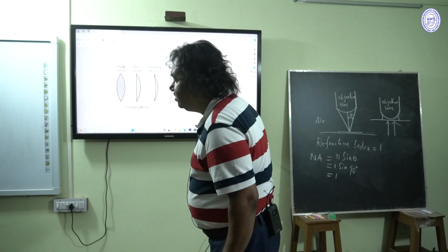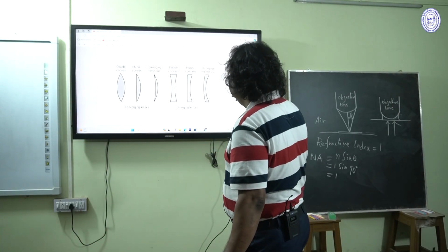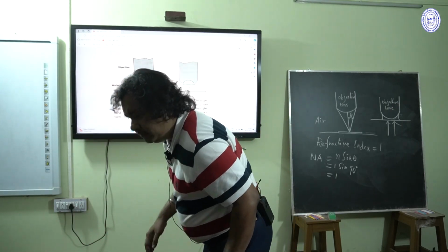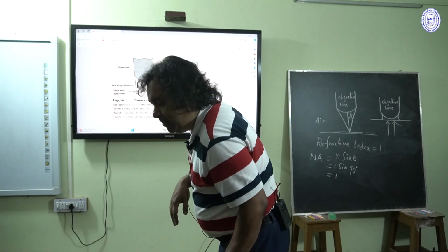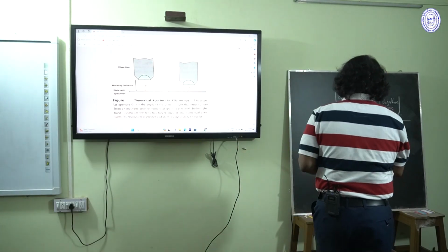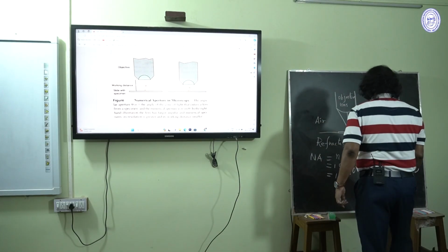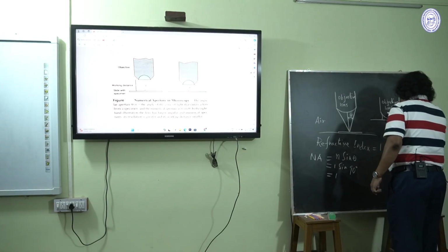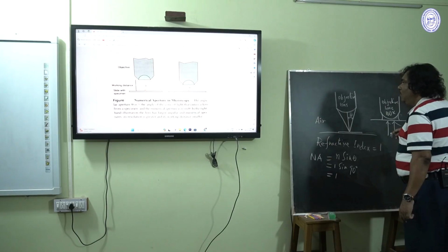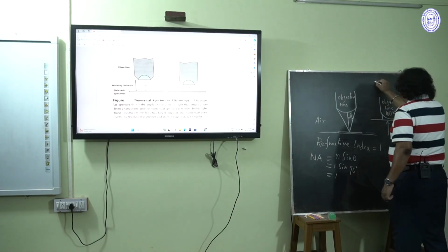These are the various types of lenses present. This is the numerical aperture of the microscope that I am discussing. Here the objective lens with 100x magnification is simply known as the oil immersion lens.